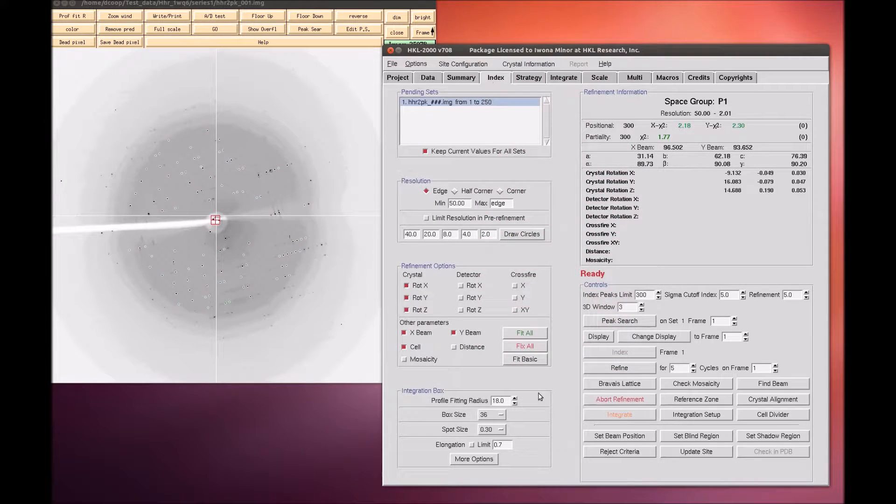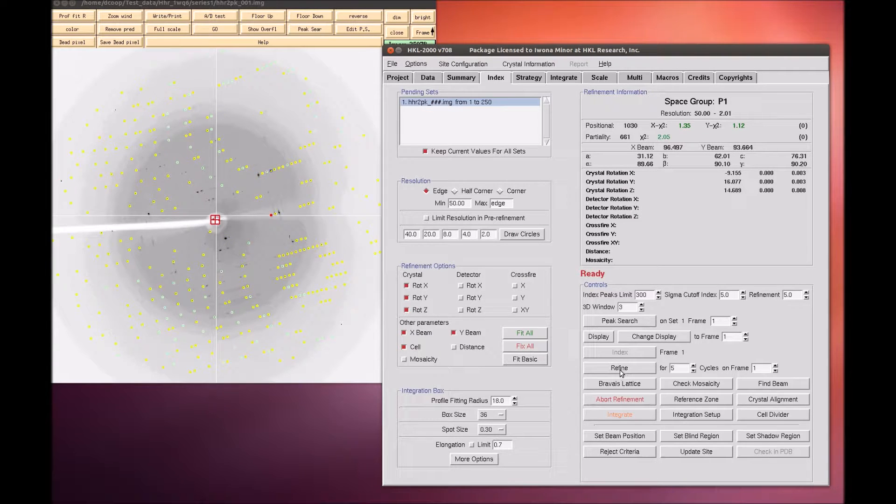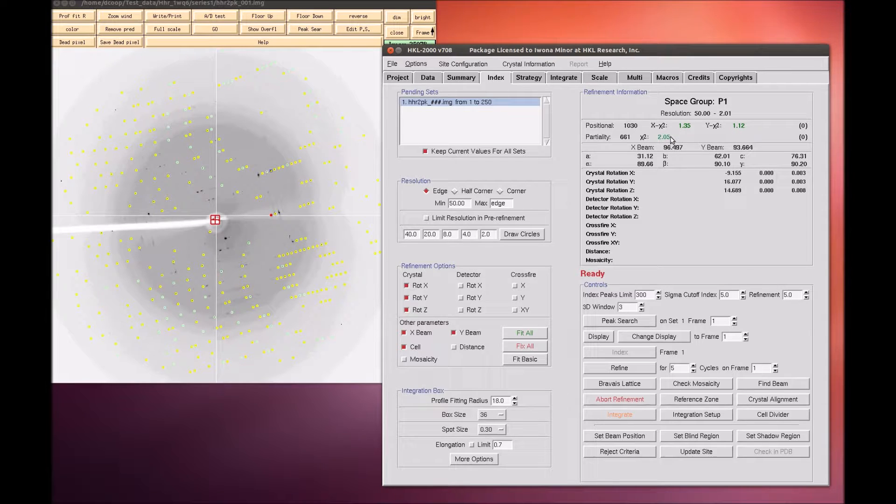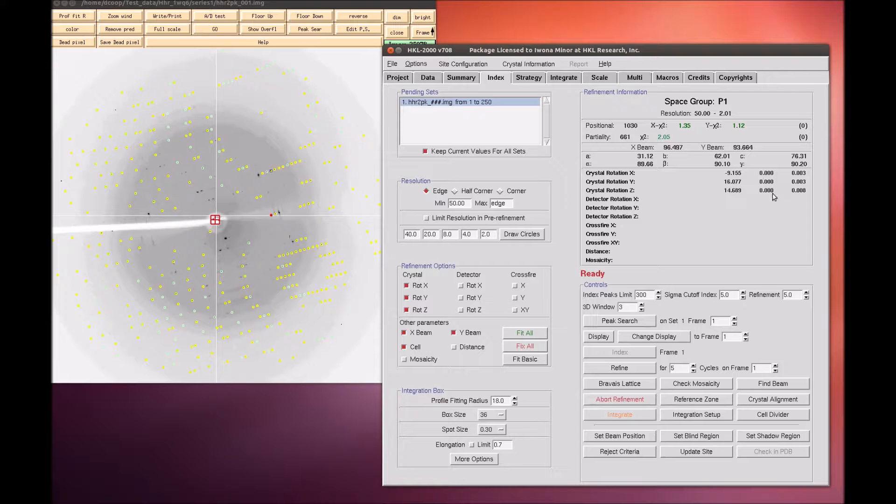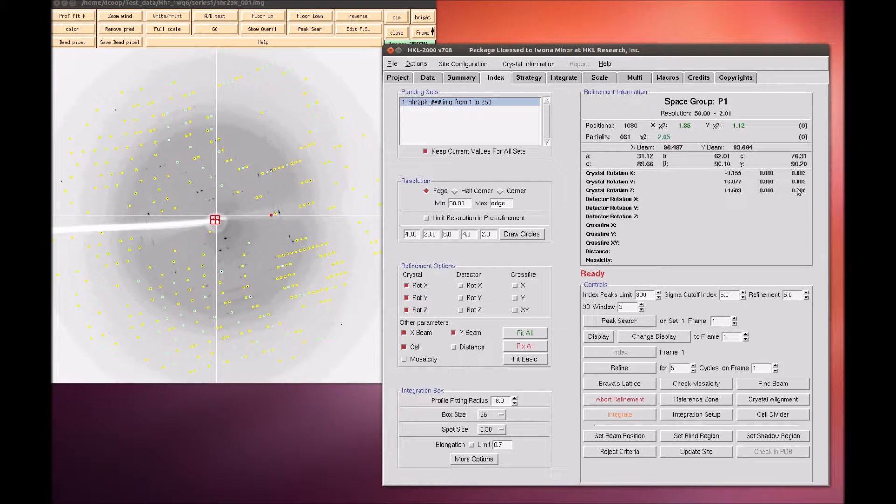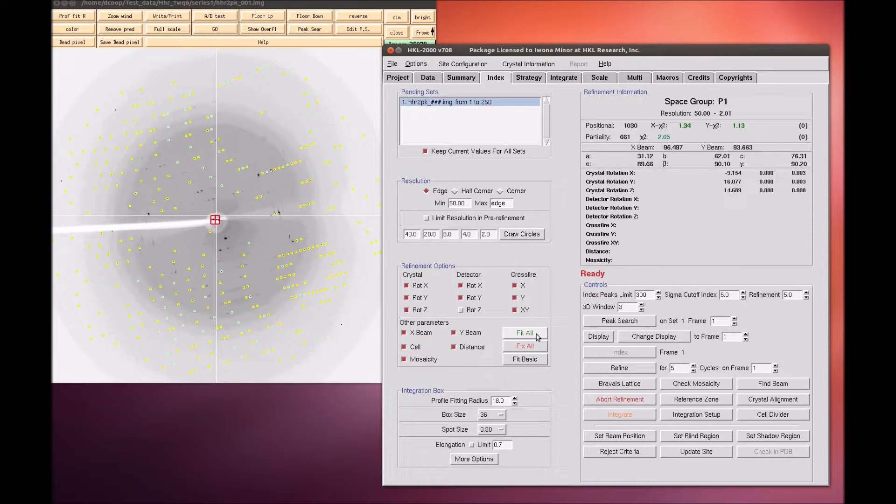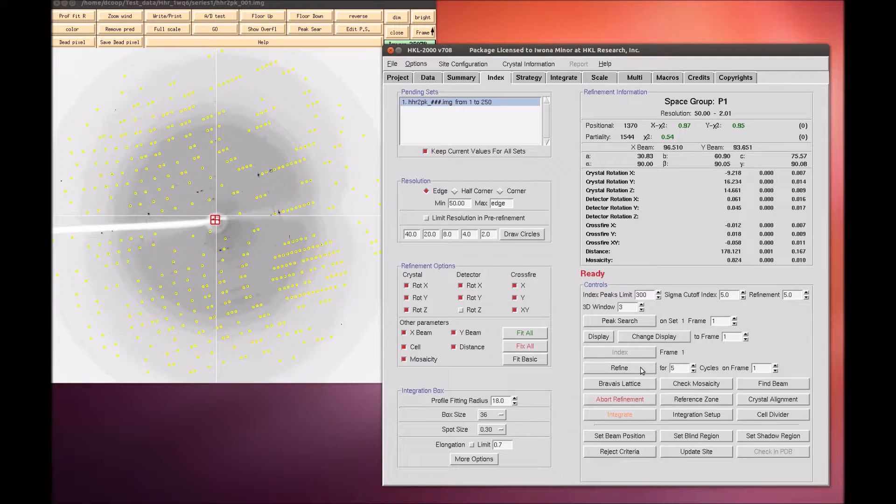To do this, apply and close this window and use the refine button. Initially, HKL will only refine a small set of parameters. The overall measurements of how well the selected crystal class fits the data are the positional and partiality chi-square values. These are also color coded from dark green to red for good to bad. The values that are being refined are presented with their current values, how much they have changed during the refinement cycle, and the error associated with the value. Click refine several times and the value should become stable. You can then add more parameters by selecting fit all in the refinement options box. Click refine again until all the parameters become stable.